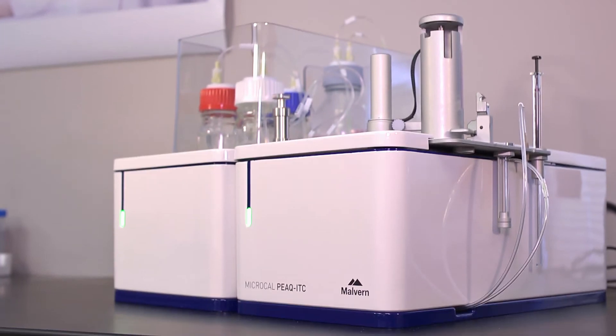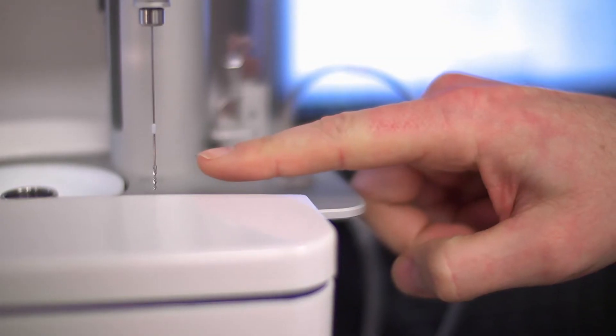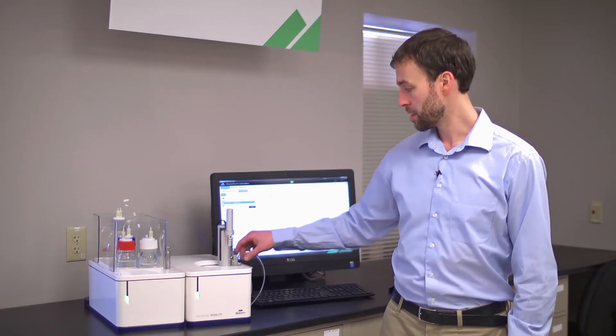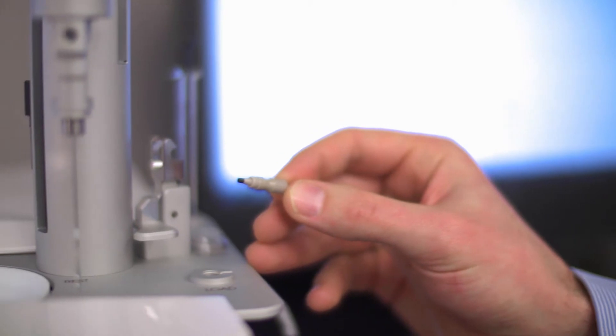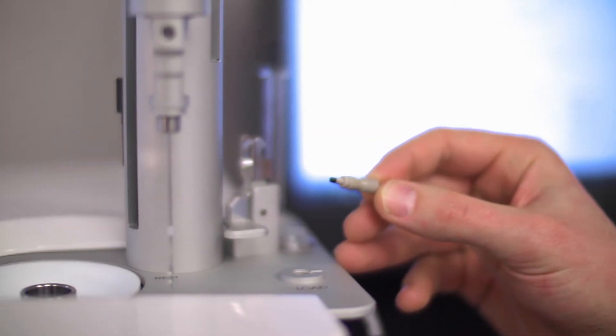Also improved on the MicroCal PEAQ ITC is the pipette and titration syringe. The one-piece fill port adapter with conical Kel-F tip eliminates syringe hole misalignment. The titration syringe and newly designed stirring paddle is manufactured more robustly and improves mixing.